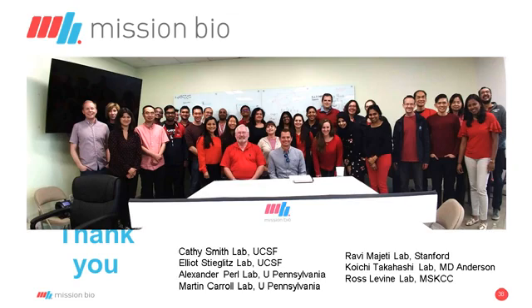We have gone higher than this, we just haven't made it available on the Tapestry Designer tool yet. It's something we can definitely have a conversation about if needed. The real challenge becomes how much sequencing cost is possible. As we make the panels bigger, the cost gets much higher.